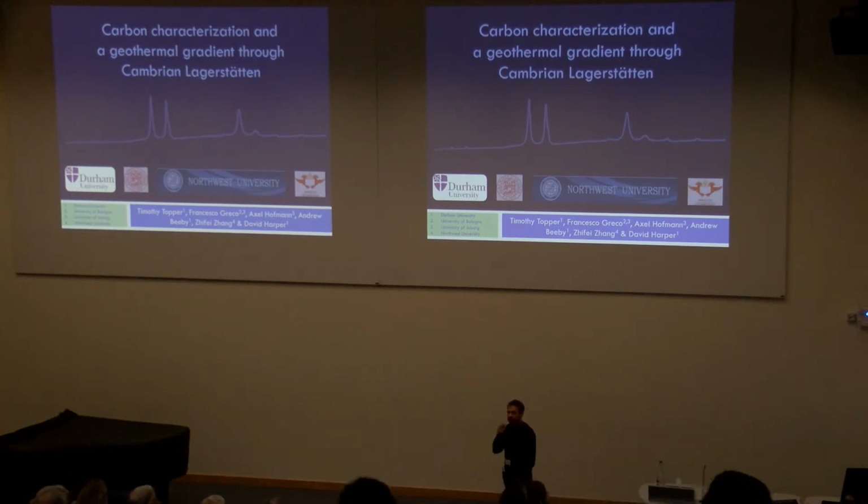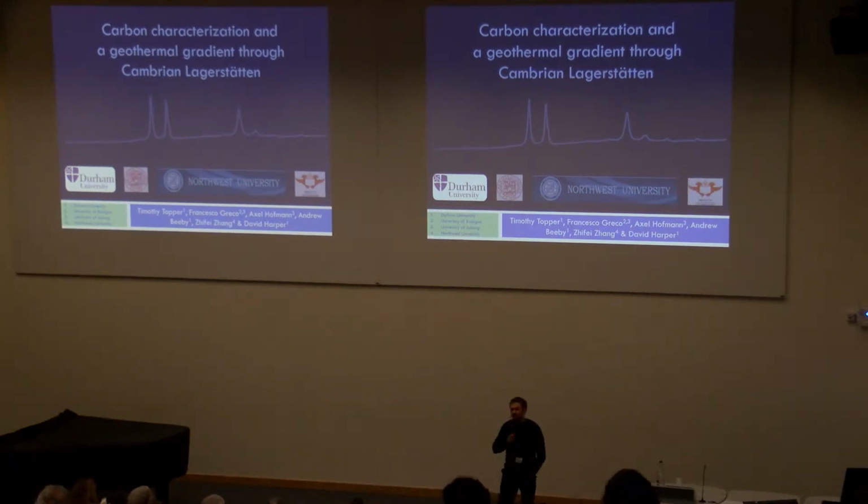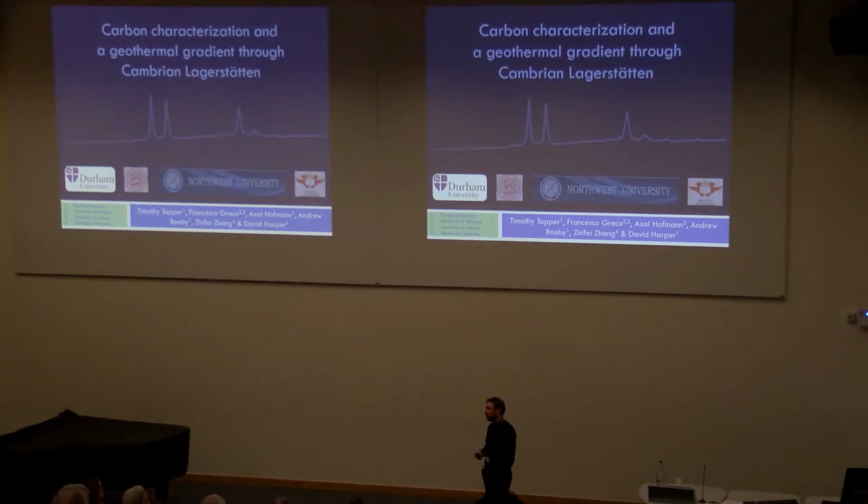Okay, so Raman's been used relatively extensively, I'd say, to evaluate the origin and the nature of carbonaceous matter in some of the Earth's oldest rocks. It hasn't been used so much in the Cambrian, though. Raman is used predominantly in these studies to look at the structural order of carbon, because the structural order of carbon gives an indicator of metamorphic grade. It's influenced heavily by peak temperature.